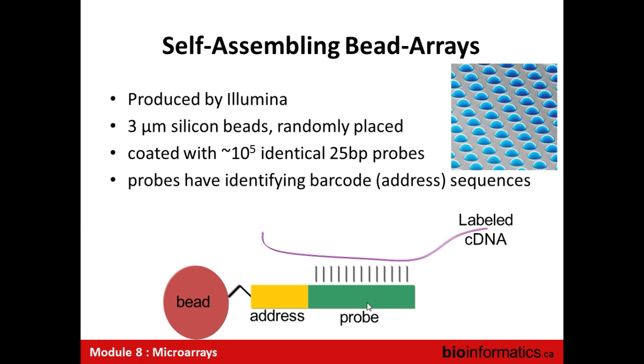That's a kind of interesting idea. So the hybridization happens on those slots, and for some genes, you're going to have many identical balls measuring that gene. So it gives you a great assessment of internal error. On the other hand, your ability to measure that error is going to be different from spot to spot. So some genes are going to have only a couple of balls, maybe one or two. Other genes are going to have 10 or 15 balls. And so some of them are going to have very precise estimates, some of them you'll have less precise estimates.